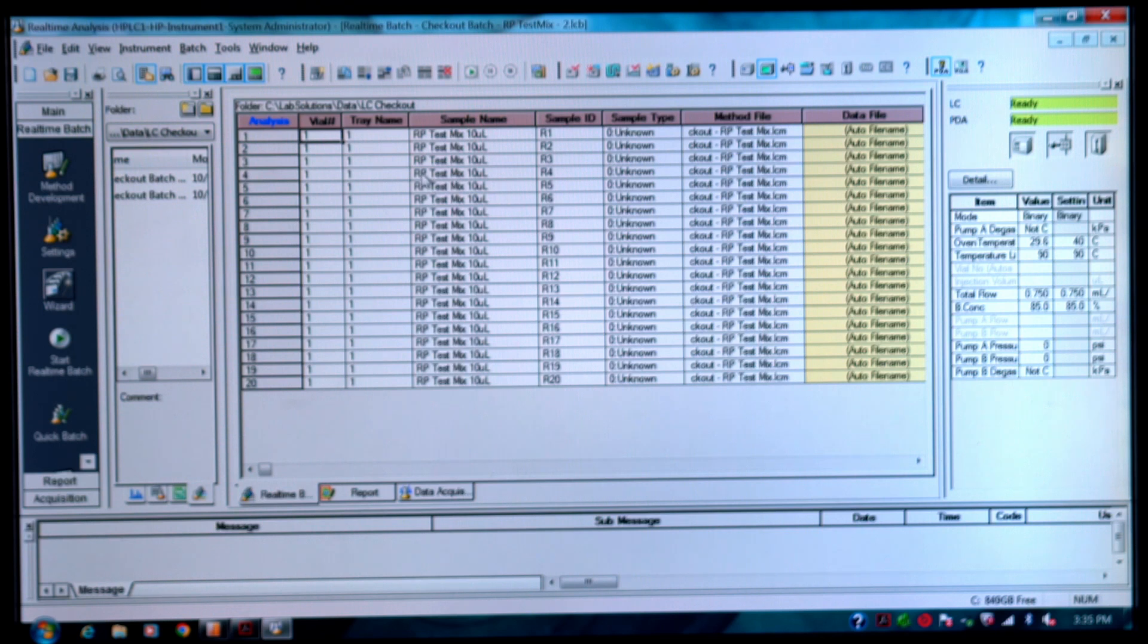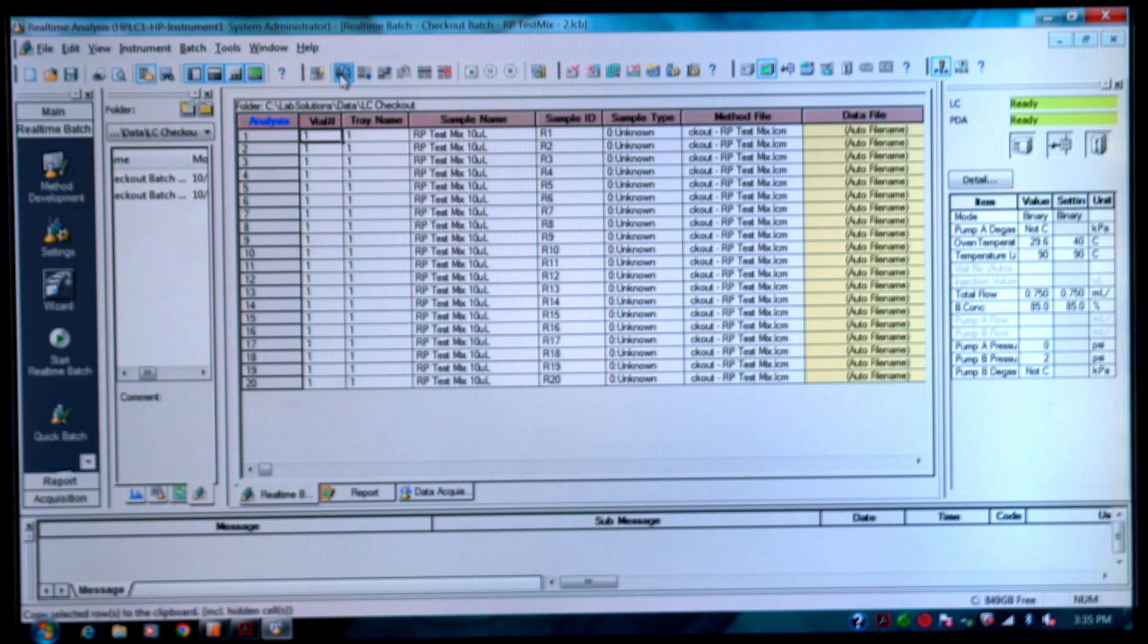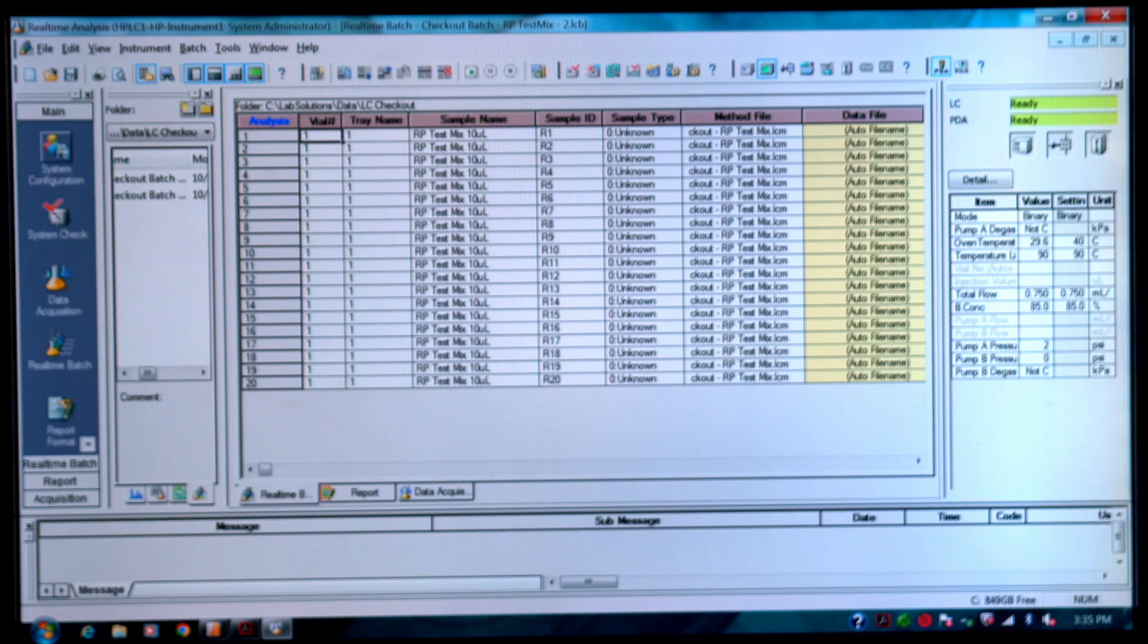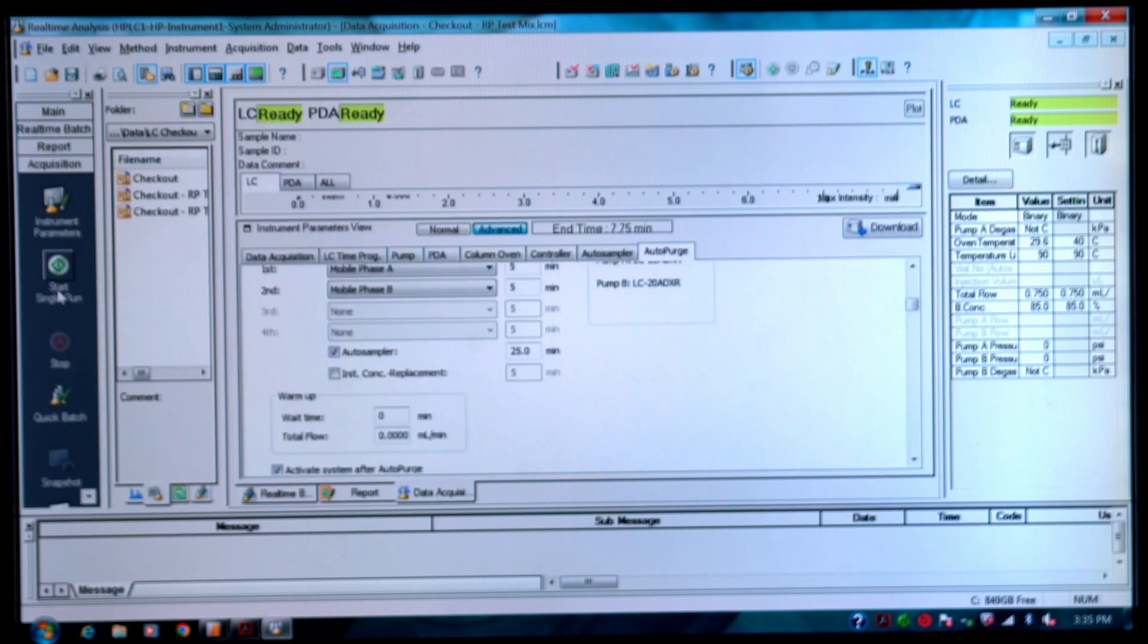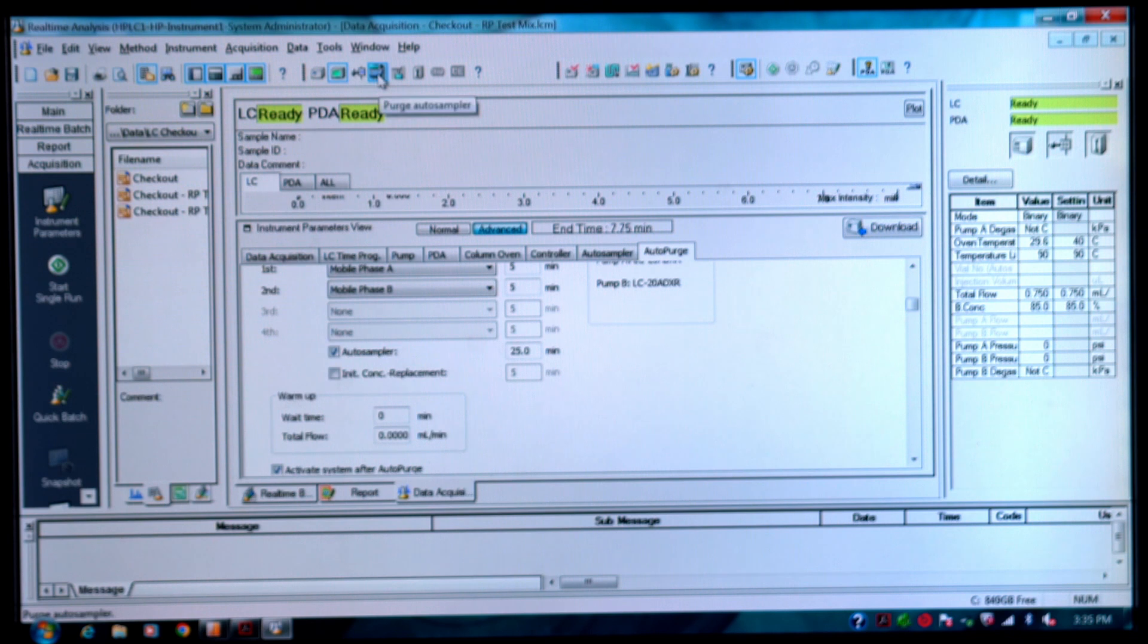Other quick shortcuts too, if you wanted to just do a quick purge of the autosampler there's this button if we go to data acquisition. If you wanted to just purge the autosampler then there's also this button here where you could do the purge just from clicking here.